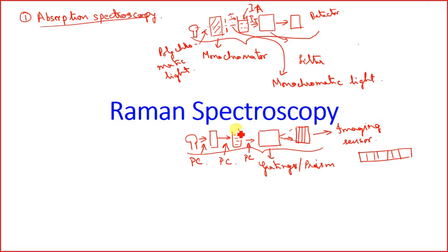Over here also we are doing the same thing. Here we have I0, the light photons which are passing through are IT, and then IA is what is absorbed by the solution, and that is what we are calculating. So this was absorption spectroscopy.